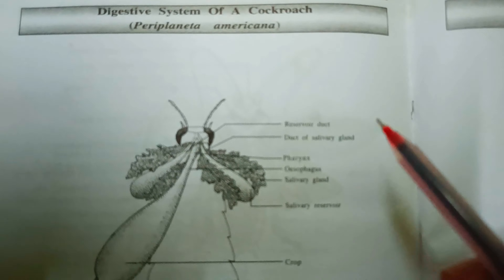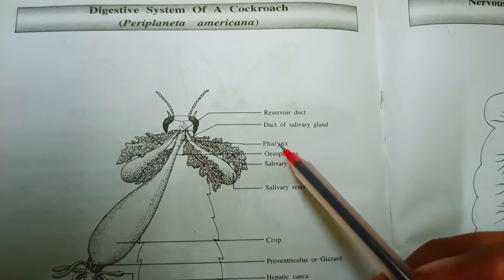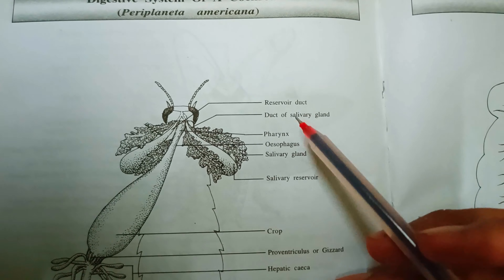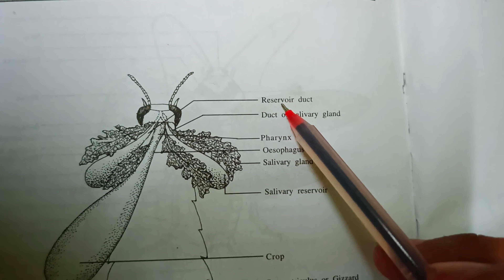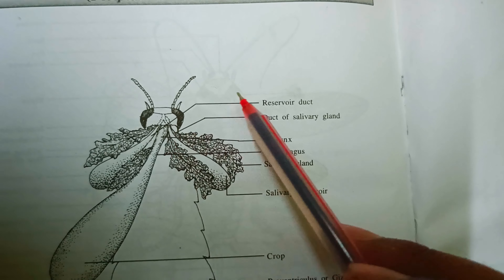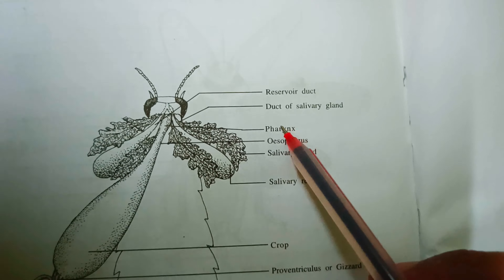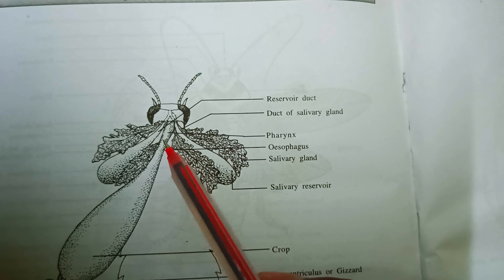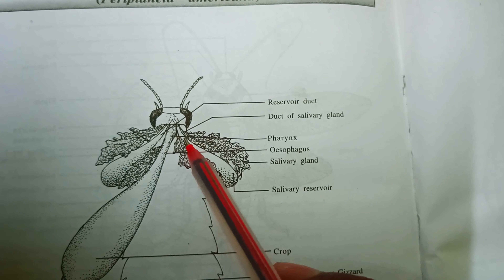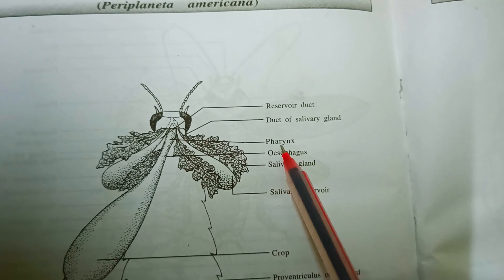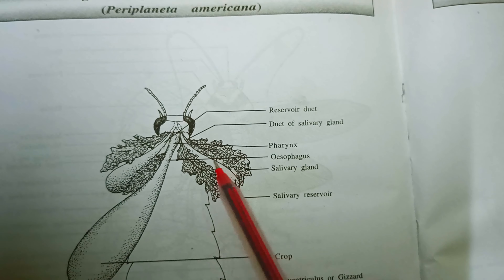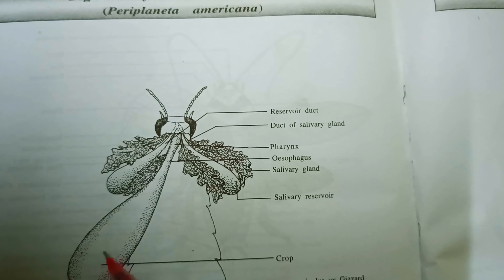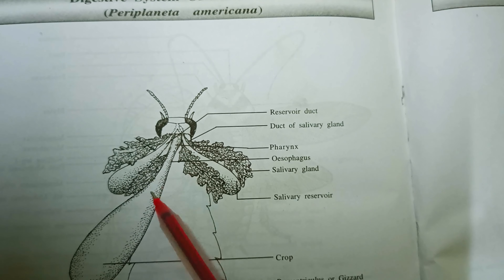The digestive system of a cockroach consists of the following parts. The first part is actually the reservoir duct. The second part is actually the duct of salivary gland. And then pharynx comes. This is the pharynx, and then esophagus. This big part is actually the esophagus.